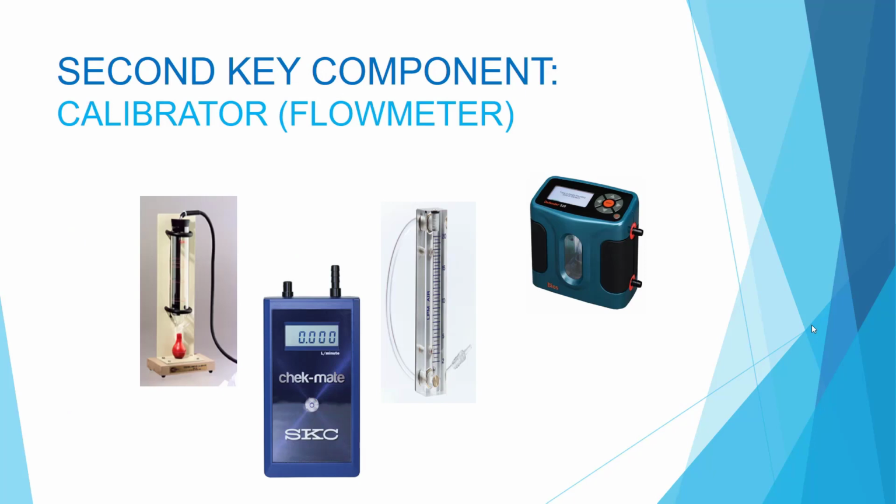Now we will move on to the second key component for air sampling, the pump calibrator, also referred to as the pump flow meter. I'm sure many of you use a lot of different types of meters in your job. A pump flow meter simply tells you how much air the pump is pulling. That's it.